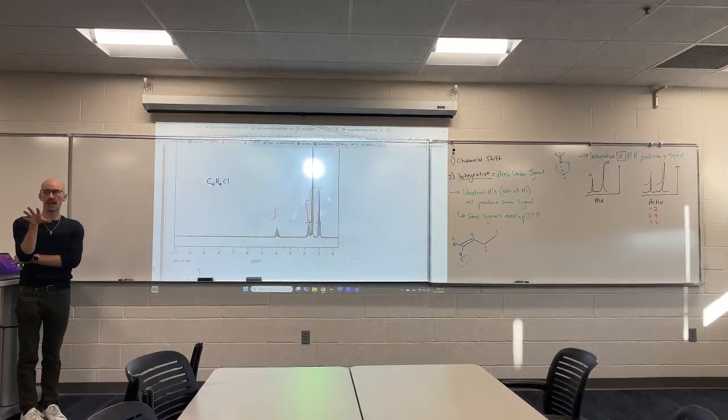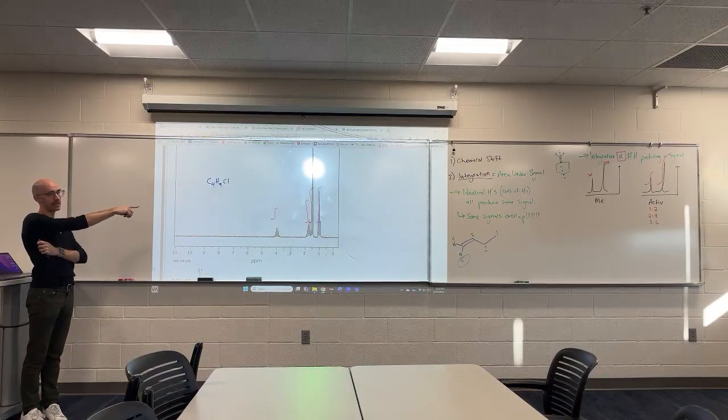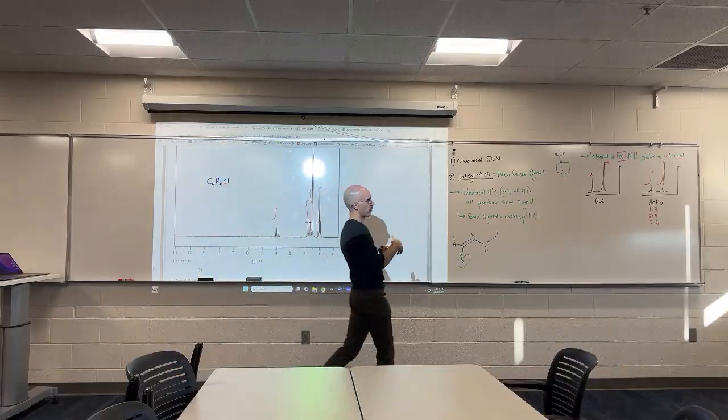Why don't you guys spend 5 minutes in your groups discussing how you can break those 9 hydrogens up to provide integrations for these signals, okay? Assign them with these 1H, 2H, 3H, 4H type stuff.